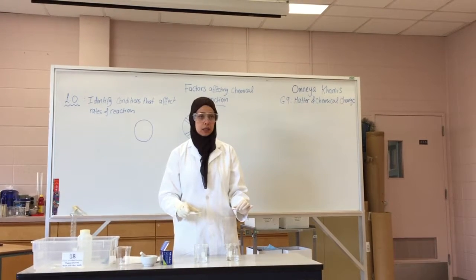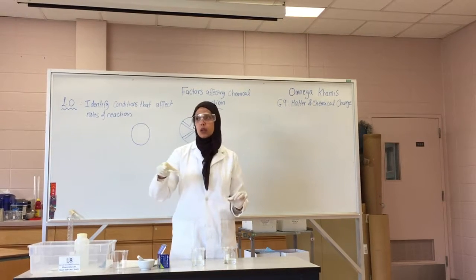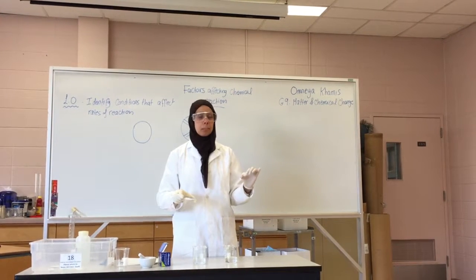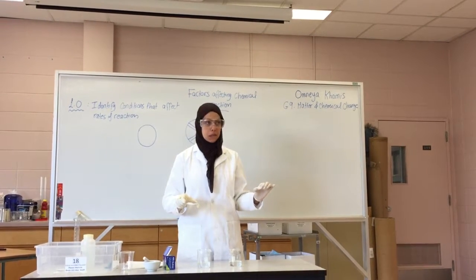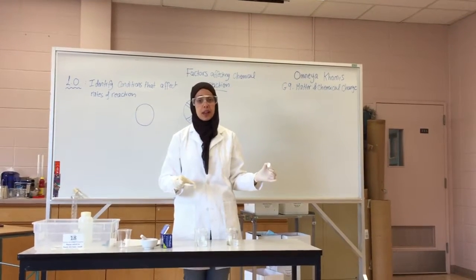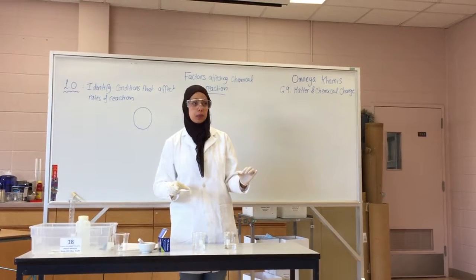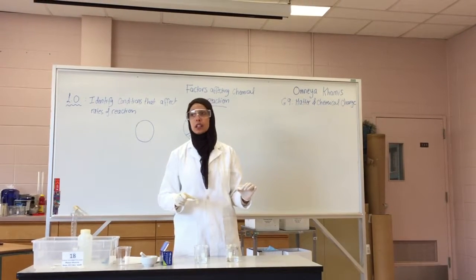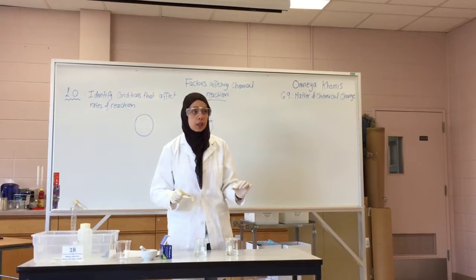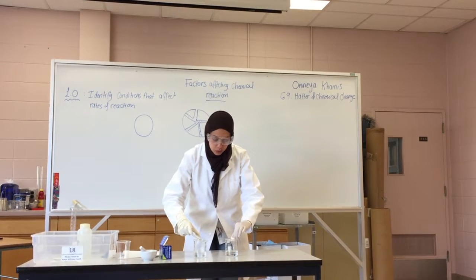Which one do you predict will react faster with water, the whole or the crushed? Crushed. Can you explain why? More surface area. Because it has more surface area. So I told you to record till the reaction stops, right? Okay, and for those who are not recording, record your observation, right? So 1, 2, and 3.